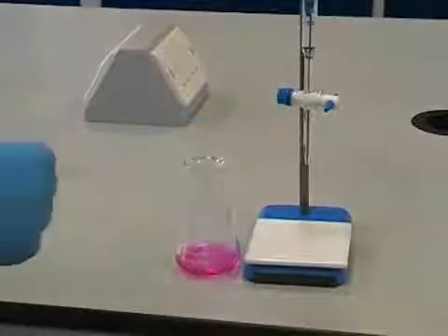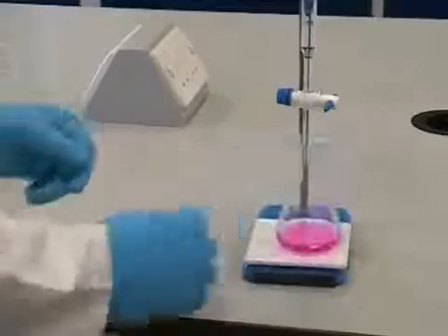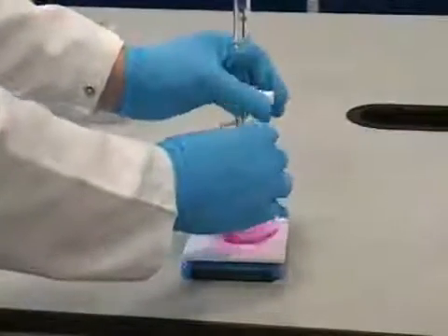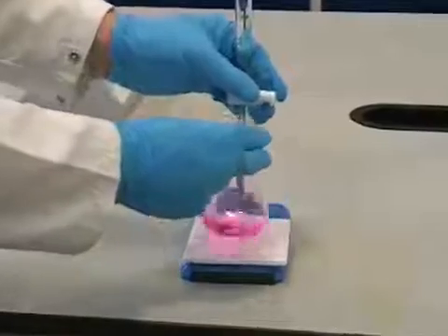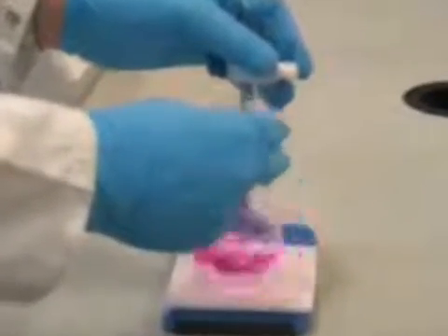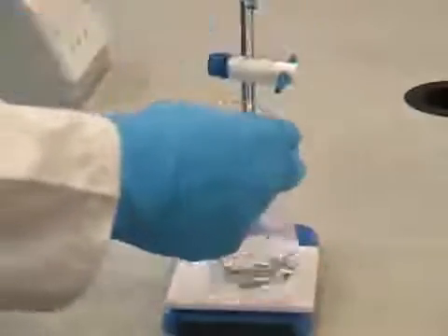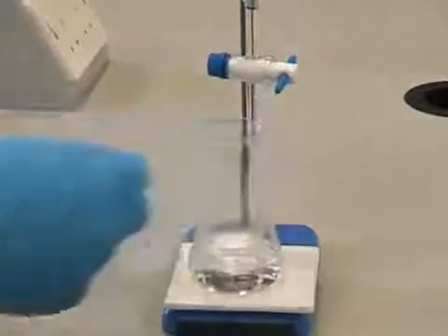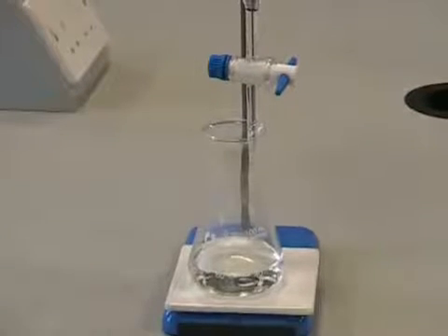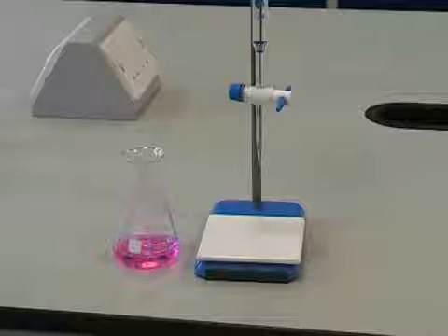Now we can carry out a rough titration, sometimes called an overshoot titration, to find out roughly how much of our other solution is needed to neutralize the solution in the conical flask. This is done by adding the solution from the burette until we see a permanent color change. We can now work out the volume of solution which we added from the burette by noting the final burette reading and performing a simple subtraction.